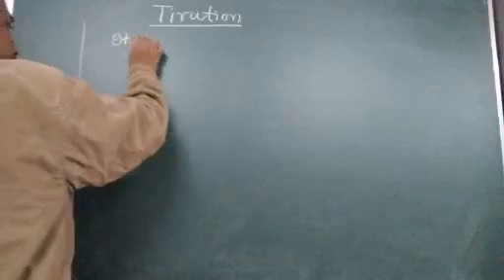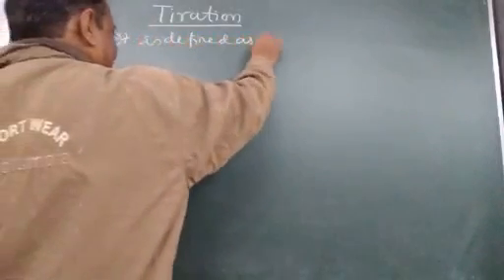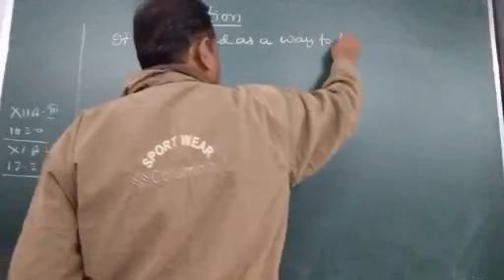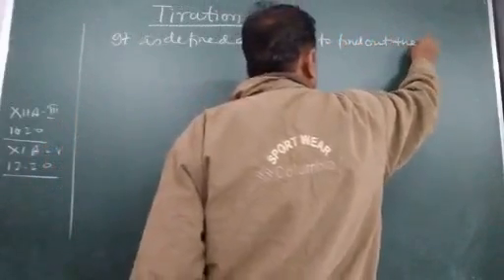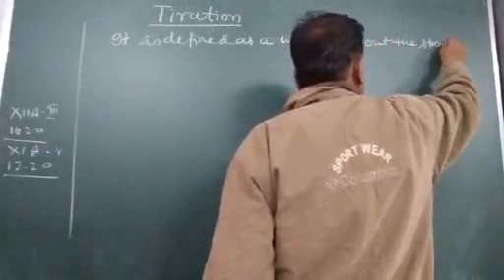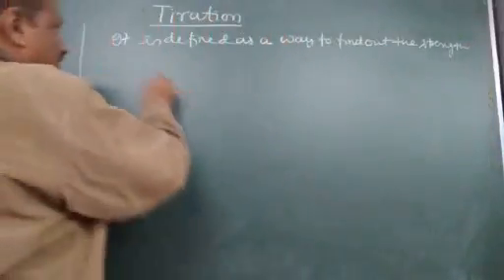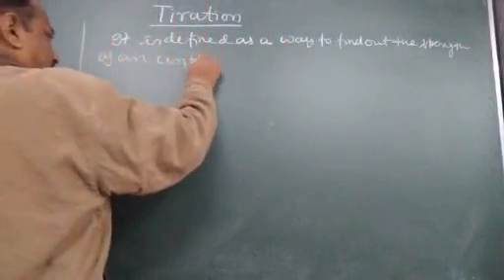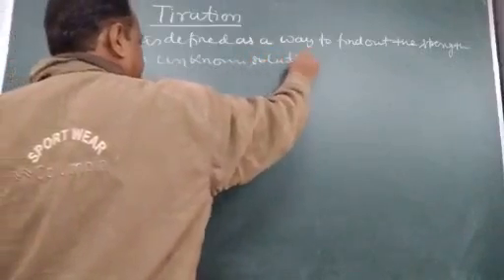And so it is defined as a way to find out the strength of an unknown solution.